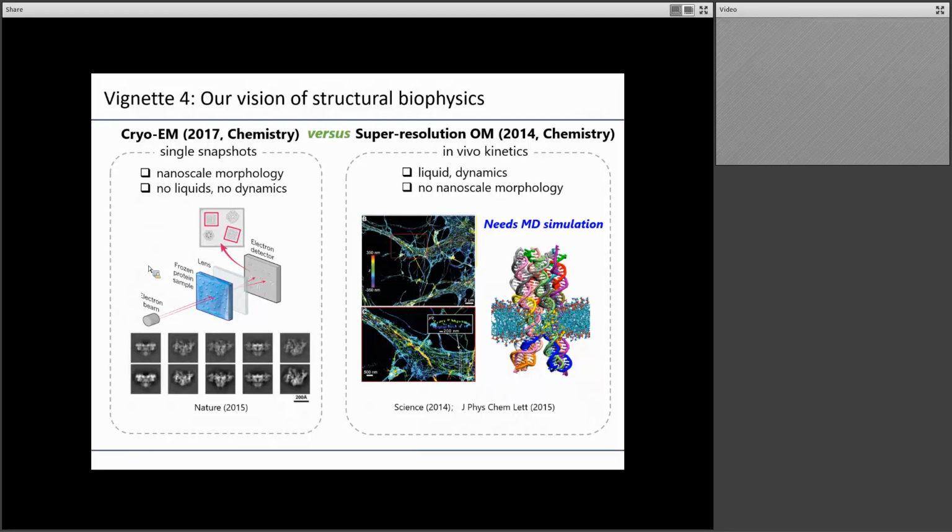So one can get beautiful resolution 3D shape through single particle analysis and reconstruction. But the samples are vitrified. They are only snapshots without dynamics. One cannot really study the motions, interactions, self-assembly, or just an in situ response to external stimulus.